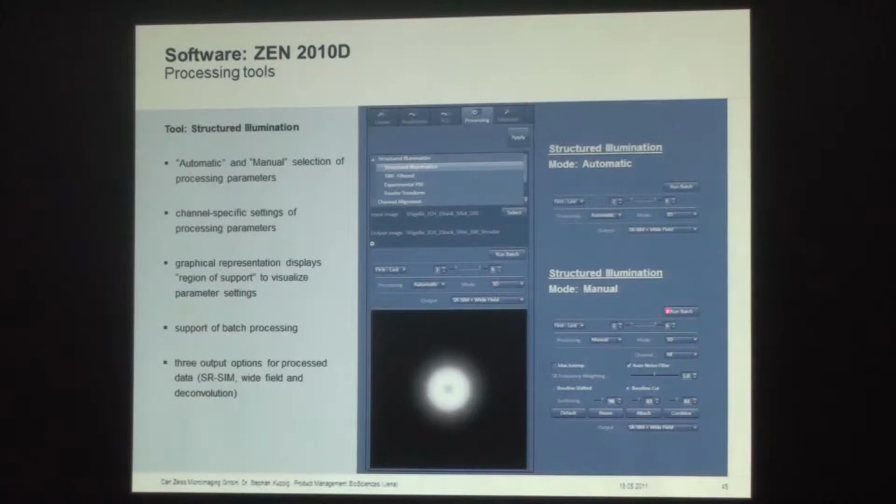So there are main functions in this. There are particularly 2 things in the calculation which are done mostly automatically, but you can do that manually too, to compare how the data changes. The 2 things I would like to emphasize here are the noise filter with the baseline cut and baseline shift, and the super resolution frequency weighting.